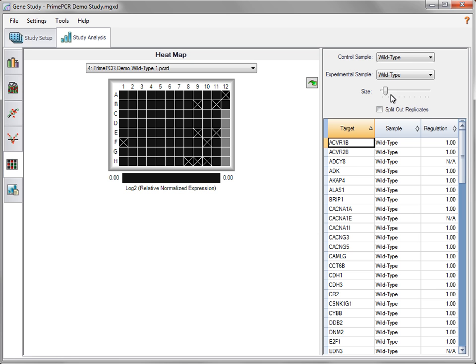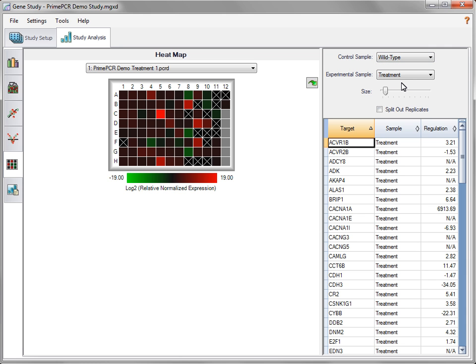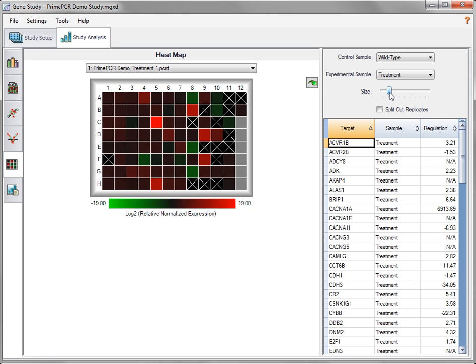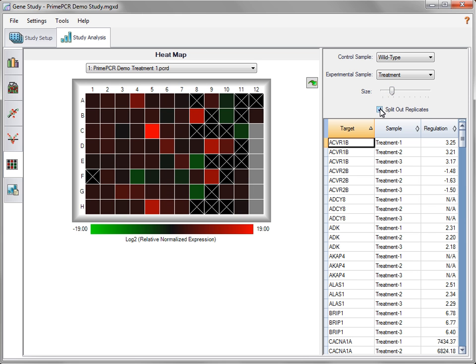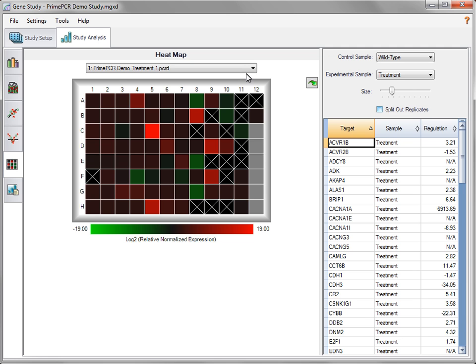In a heat map, normalized relative expression for each well is depicted by a color-coded square. Red indicates an increase in relative normalized expression or upregulation of a target, green indicates downregulation, and black indicates no change. Use the drop-down menus to select the appropriate samples for analysis. Adjust the size of the image by clicking and dragging the slider until the appropriate size is reached. To split out and display replicates, check this box. If there is more than one plate being used for data analysis, select the one to analyze from the drop-down menu.